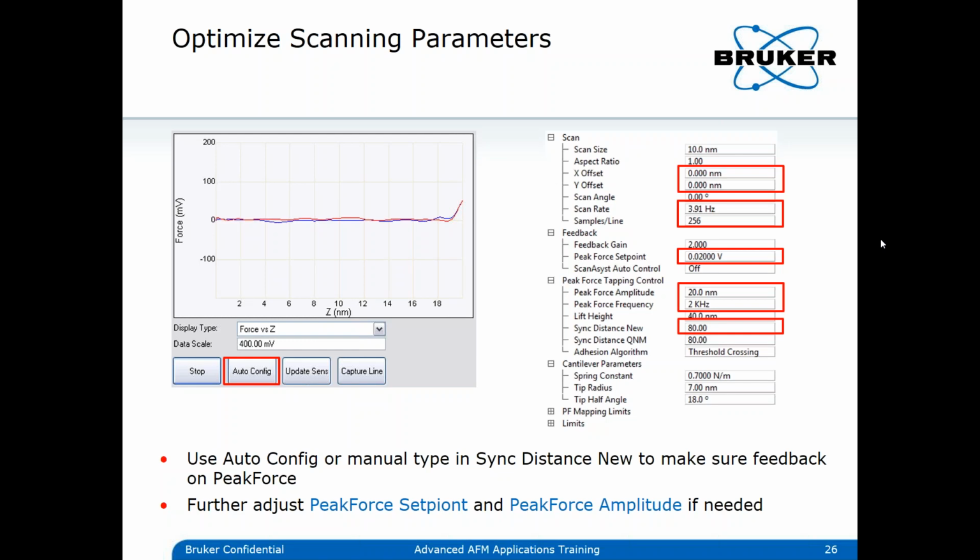Again, there are some ways. You have to look into the literature. From my personal experience, in and out of the lab, ozone will help. So if you have something like a UV light, which would create ozone, you could get rid of the contaminations. And this is actually also what the Millipore system, or the MilliQ system, is doing. It's using UV light to reduce or kill the agglomerates in the water. This would be one way. Again, no guarantee there. And I know that people were using dried ice guns, which I think is a bit aggressive, but might help you. But please look into the literature for that.